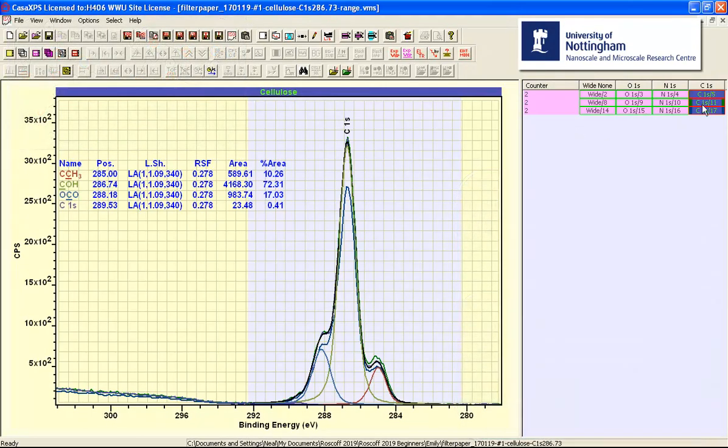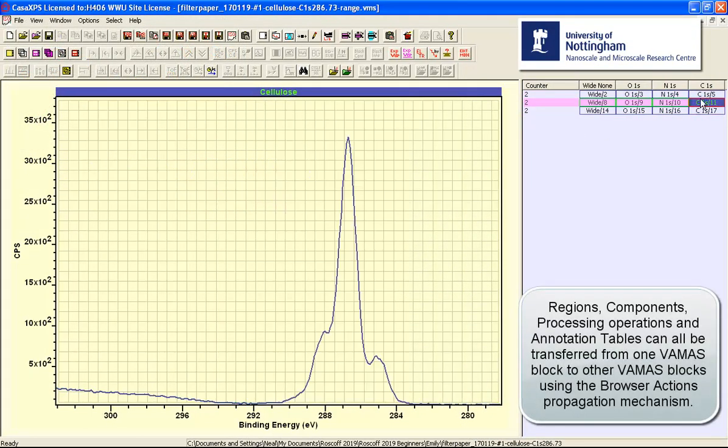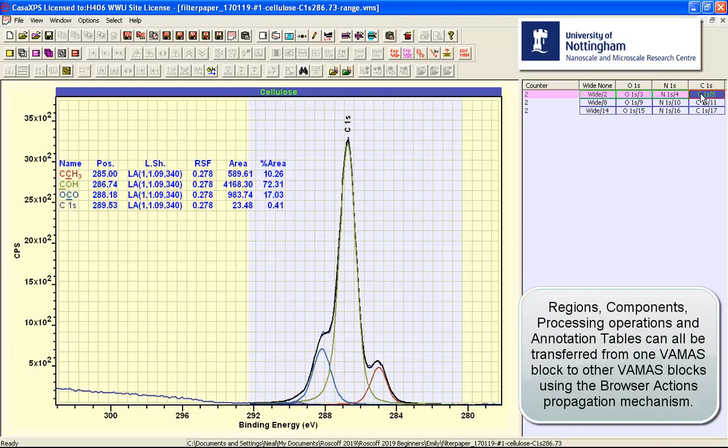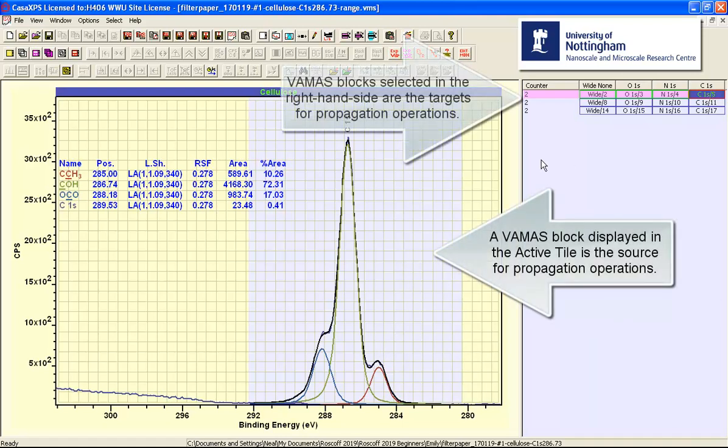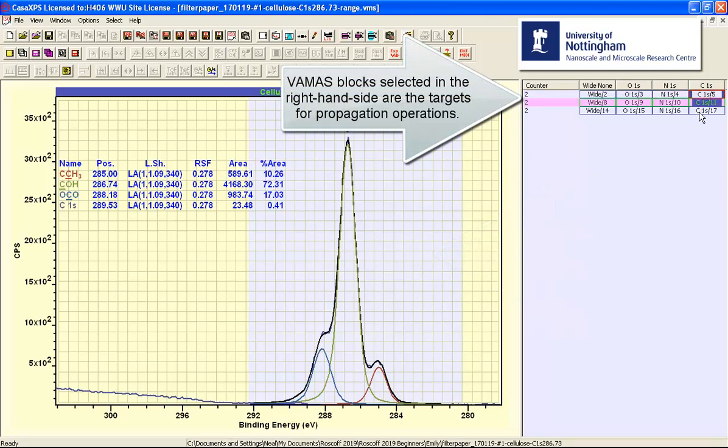What we would like to do is transfer the peak model from these prepared data to other data within this FAMAS file. And we can do this if we display in the active tile the VAMAS block that contains a peak model and annotation, and then select the other VAMAS blocks for which there is no processing other than the energy calibration.